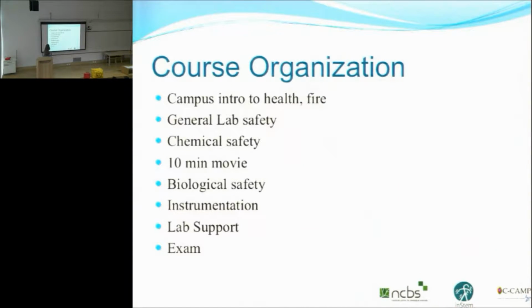I want to give you a brief overview of how I'm going to structure today's class. We'll talk briefly about the campus in general, like fire and health. We'll move into general lab safety, transitioning to chemical safety. There's a 10-minute video that I think is the best video I've ever seen for how to work effectively in the lab. We'll talk some about biological safety. I'll introduce you to our instrumentation team on campus, as well as the lab support team. And after that, I'll pass out the exam, and you'll take the exam.